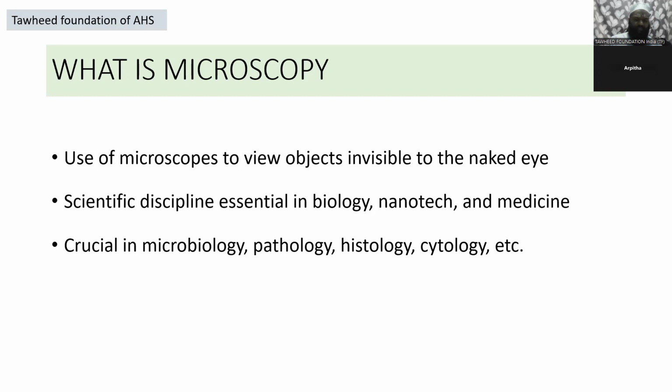It is a very important tool in biology and nanotechnology. In microbiology, it is one of the most important tools used in observing microbial cells. Medical sectors, pathology, histology, molecular biology, and cytology are in great depth of microscopy.